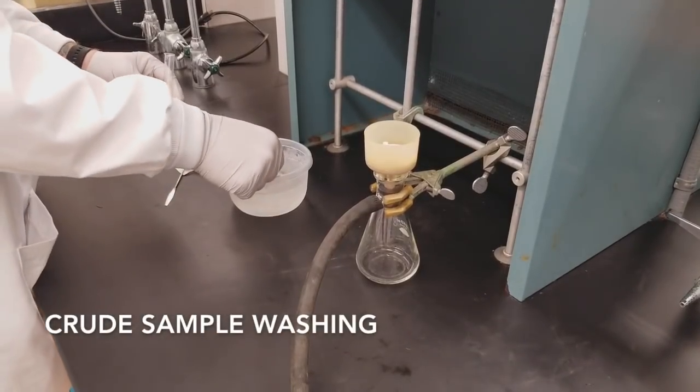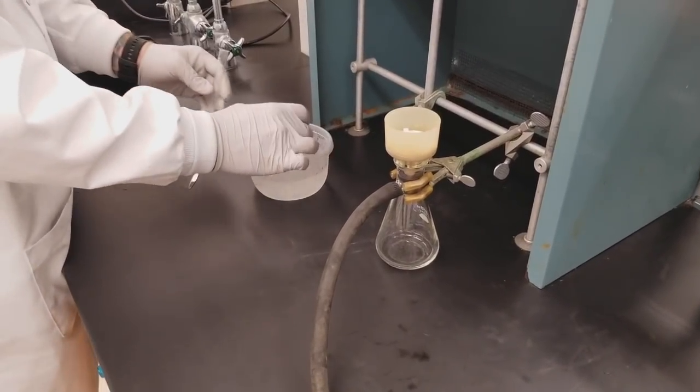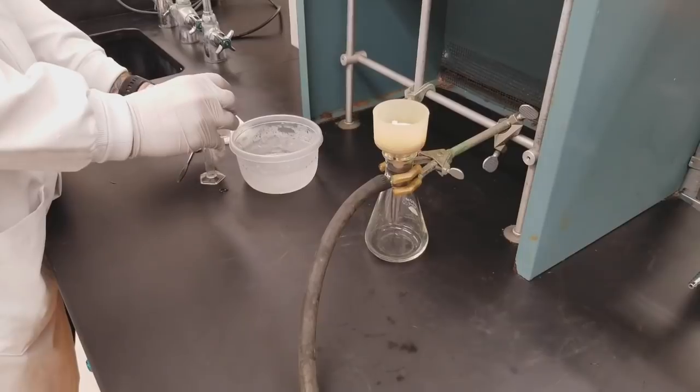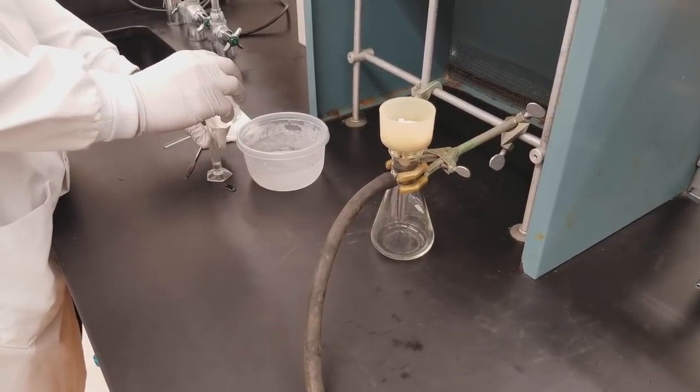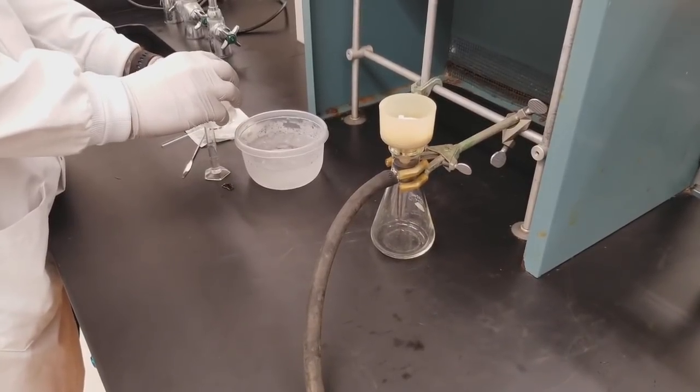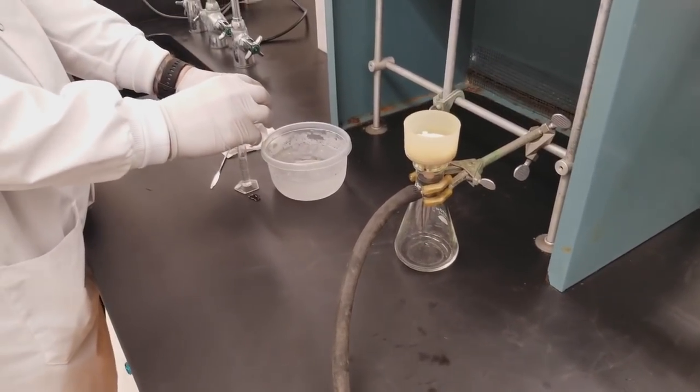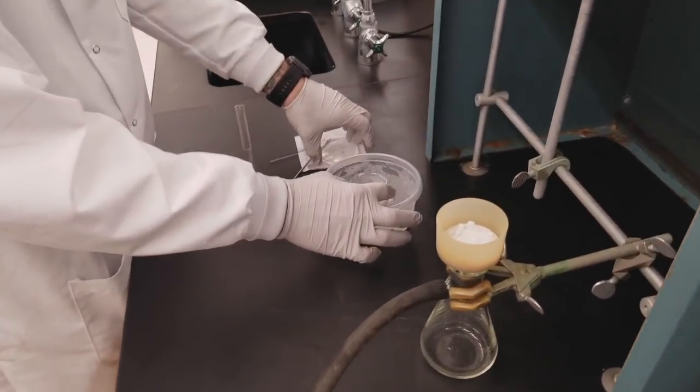At this point, we want to make sure that we wash our crystals and we're going to do that with some cold solvent. You want to measure probably no more than five milliliters for this washing step. It's really important that we use cold solvent here so that we do not dissolve any of our crude sample.